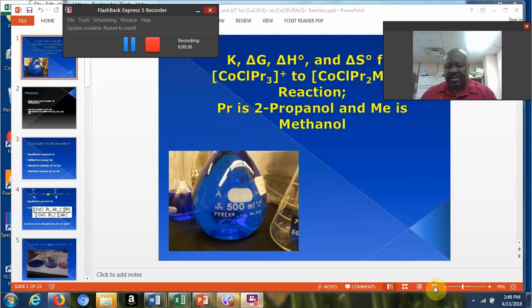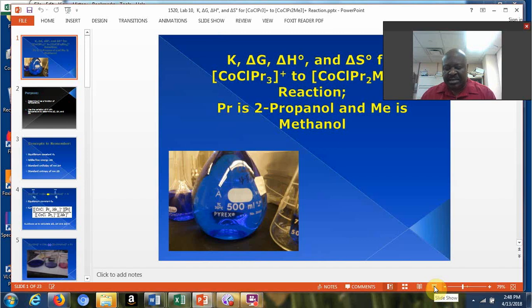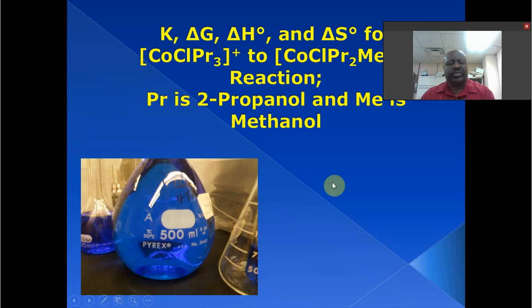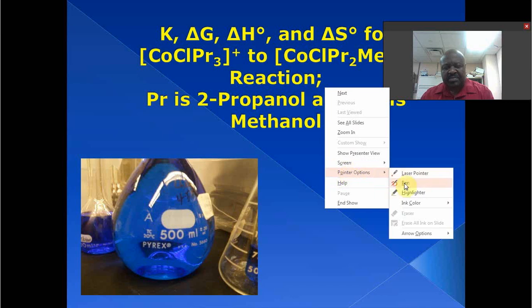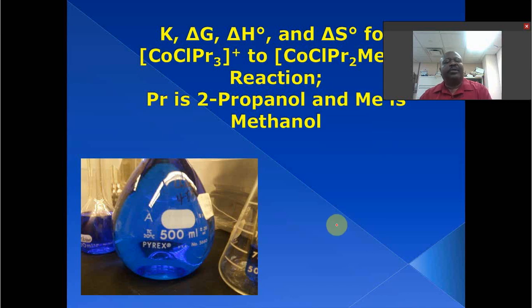All right, so let's think about our reaction this week. One slide show. All right, pick up a pen here. So we're blue this week. Blue, wonderful color. So we're going to look at determining K, the equilibrium constant for a reaction, delta H and delta S, and then from that figure out everything else.